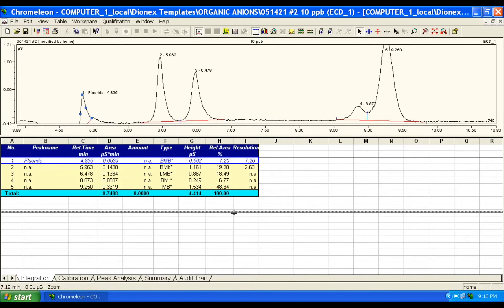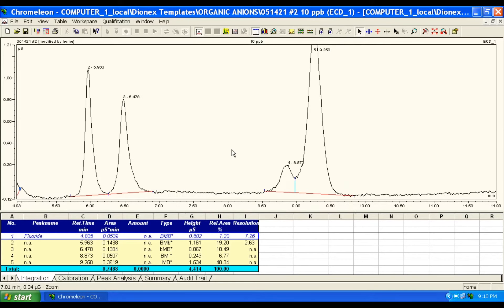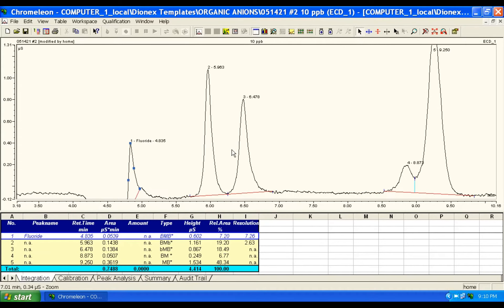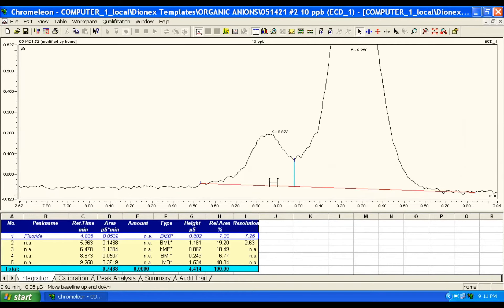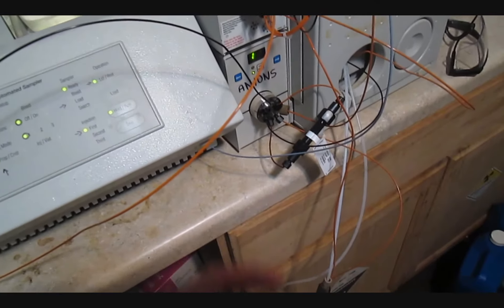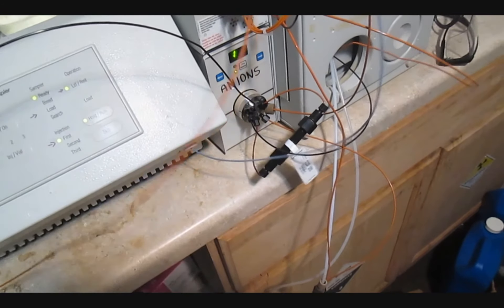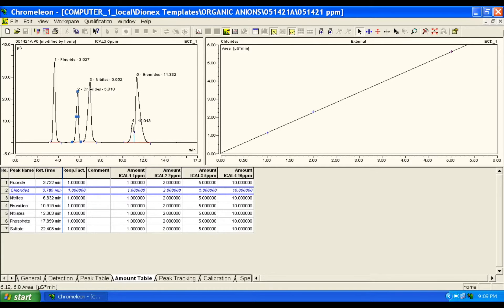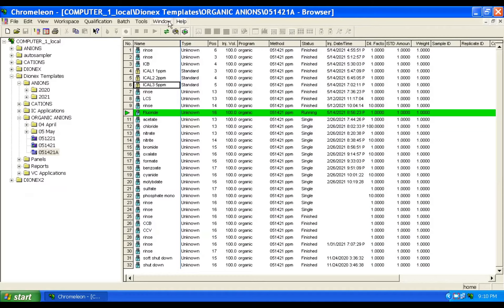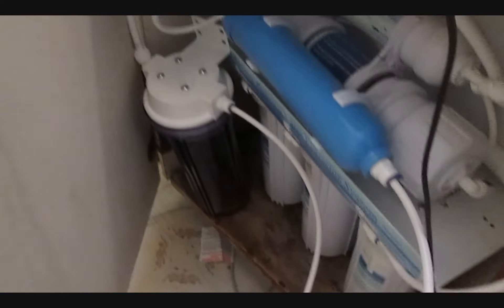I have been getting good consistent results with both columns down to the low PPM range. There's a small modification that will allow me to reach the PPB range and get a thousand times better resolution. To get consistent injection volume, I use a sample loop, but replacing it with a guard column and changing the instrument method will have the effect of concentrating my sample before injection.